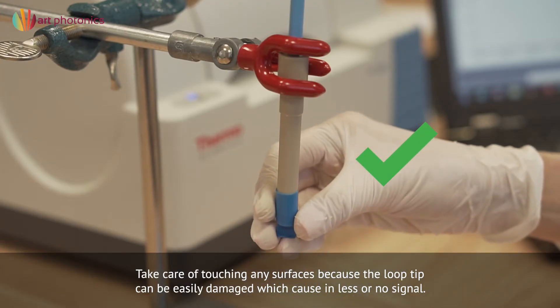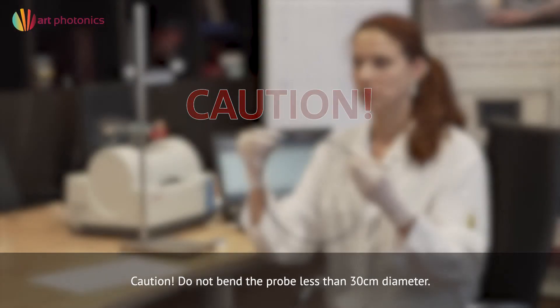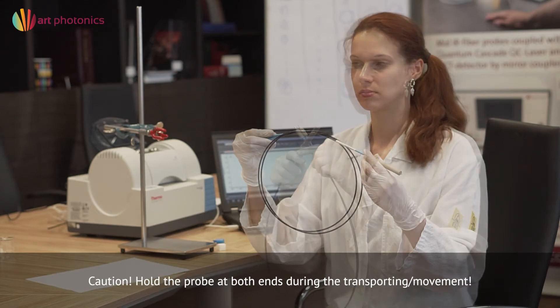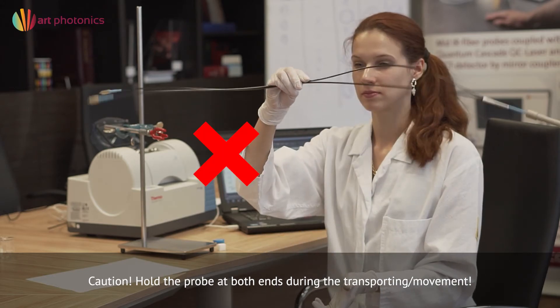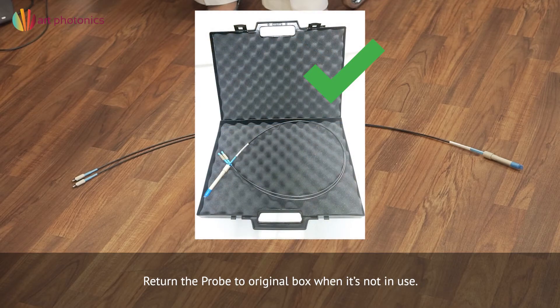Put protective caps onto the loop tip and both fiber ends of the probe when it's not in use. Caution: Do not bend the probe less than 30 centimeters diameter. Hold the probe at both ends during transporting or movement. Prevent the probe from falling down, and return it to its original box when not in use.